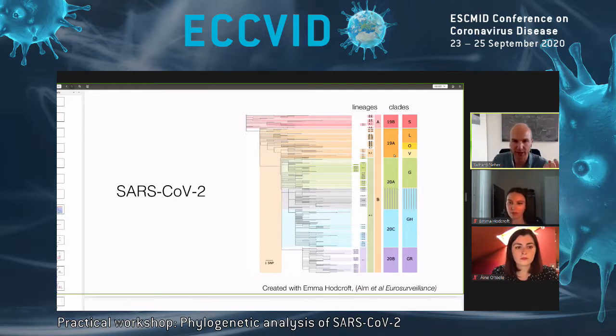Now, how do we define these clades? They're defined by a set of signature mutations, which are saved in a list that somebody asked about in the chat. What our program does is essentially walk up the tree from the root and find the first place in the tree that matches this clade definition. Everything downstream is going to be that clade, unless there's another clade definition nested within it.